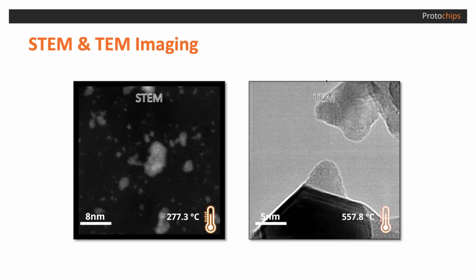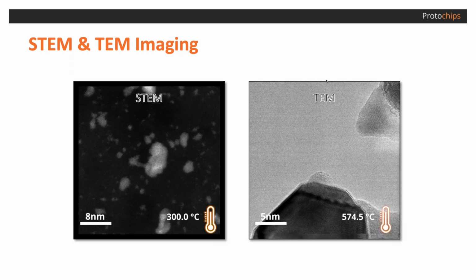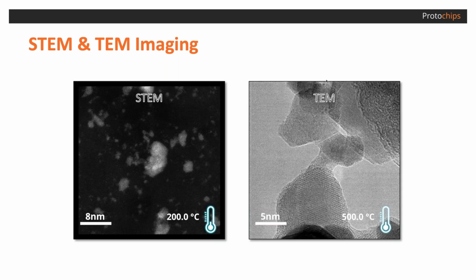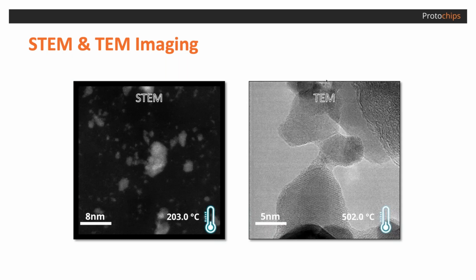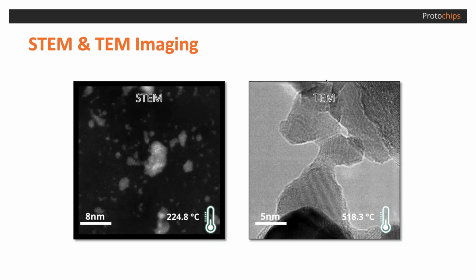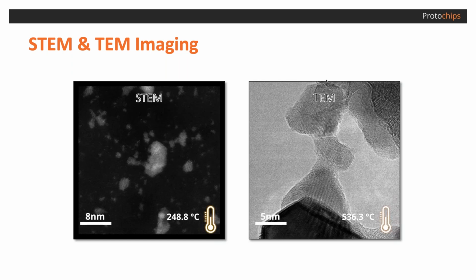This is the part where I try to address the comment that I get a lot, which is that this is just a drift correction system. Everybody's been using drift correction at some level on different systems for a long time. And drift correction in its simple state is just identifying and locking on an array of features with certain attributes or aspect ratios and tracking them as they move in space.